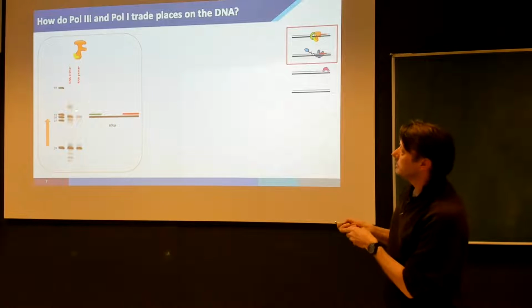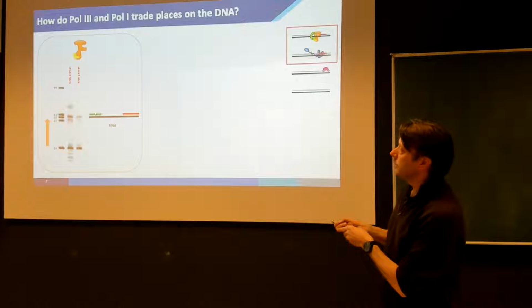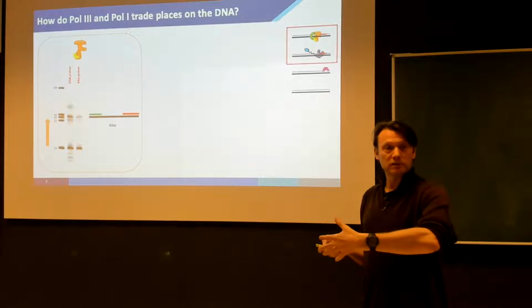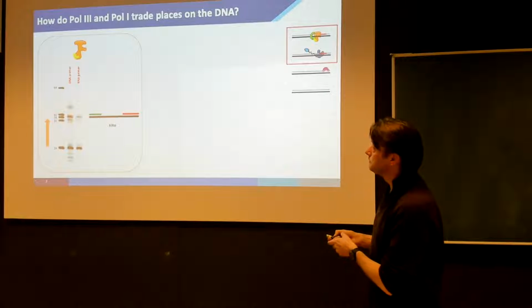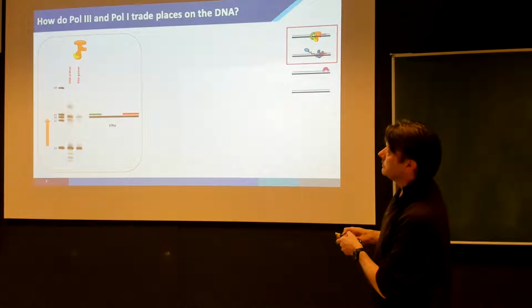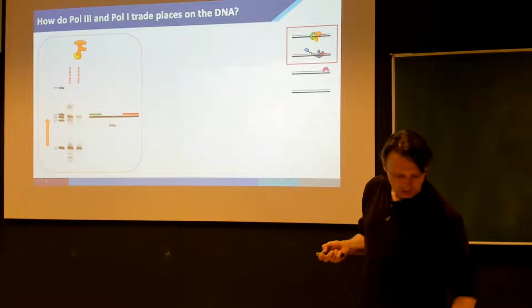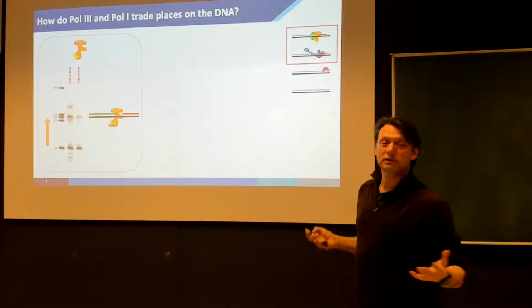So what we did is we took a DNA substrate. Here in black is the template. There is a DNA primer that will be extended by the polymerase, and this downstream primer, DNA or RNA, doesn't matter, is mimicking the previously synthesized RNA primer that the polymerase will bump into. Then we run a high-resolution DNA synthesis gel where we can monitor the length of the green primer, and we start here, and then we see synthesis going up to the middle, but it doesn't proceed any further. It doesn't reach the full 69 base pairs. So DNA Pol 3 is not capable of bypassing that RNA primer, so the literature was right.